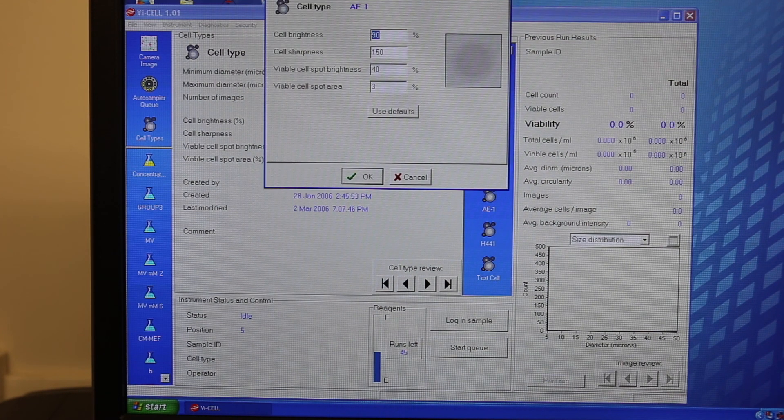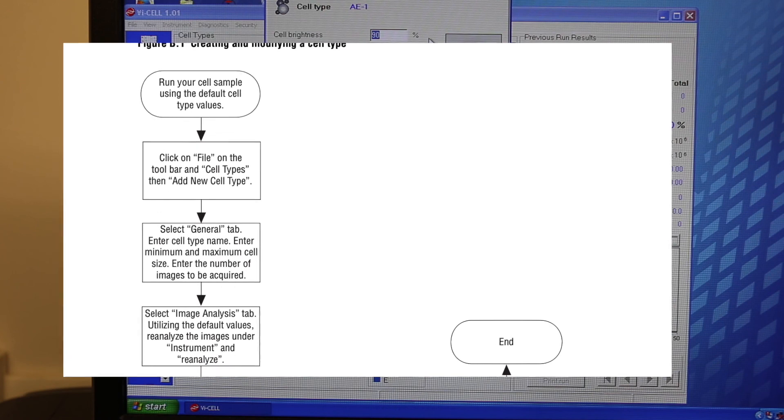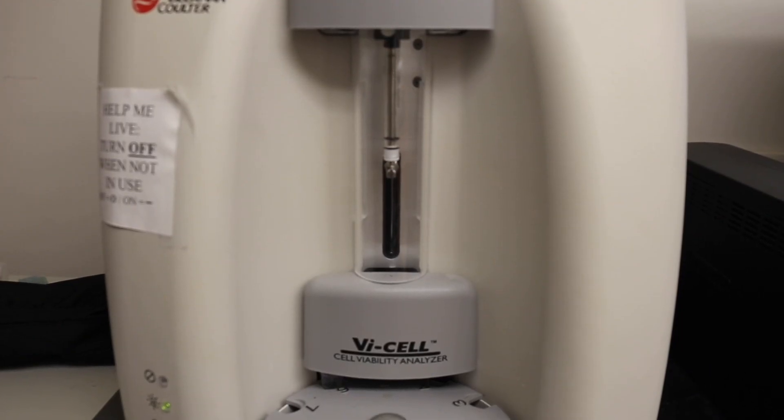To obtain accurate numbers for these measurements, we recommend that you research the cell and the corresponding measurement values, which can be found in the cell manual or through additional research online. Once you are finished programming a cell type, we recommend running at least one to two trial runs to confirm that the machine is measuring the cell accurately.